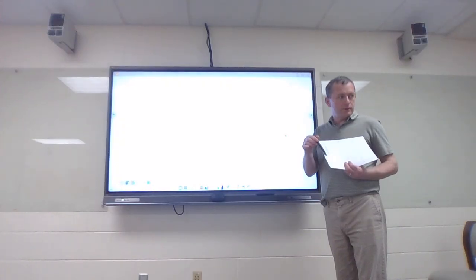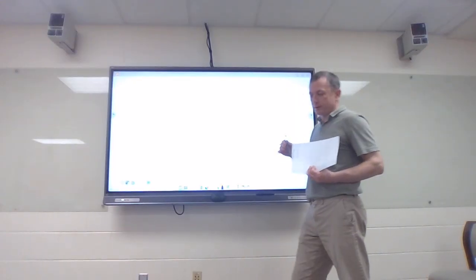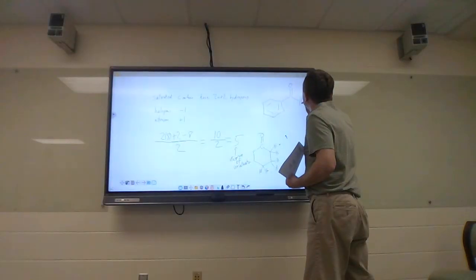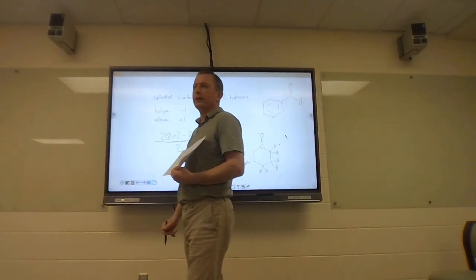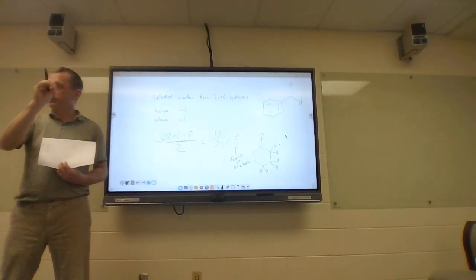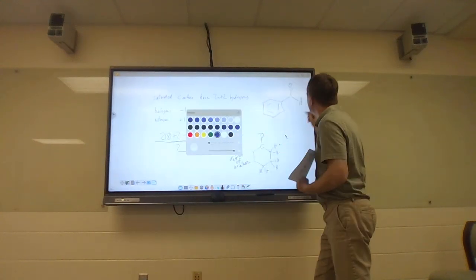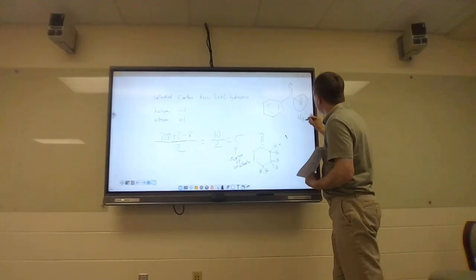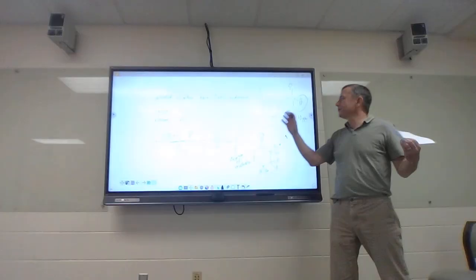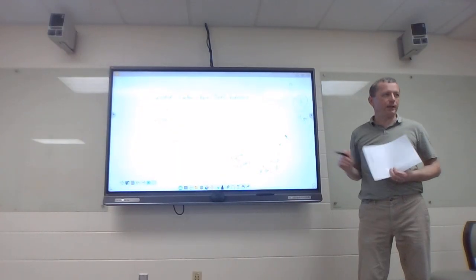The other one that sticks out like a really, really sore thumb is the hydrogen around 10. Anytime I see a hydrogen around 10, it's absolutely always an aldehyde. The hydrogen on the aldehyde carbon is almost always at 10 ppm, and what's next to it? No hydrogens. It's always a really sharp singlet that shows up right at 10. Boom! I know I got an aldehyde.